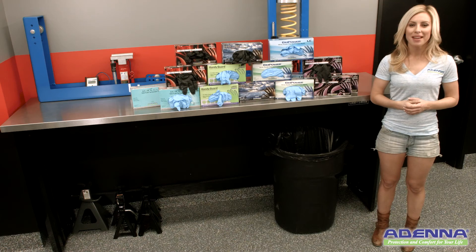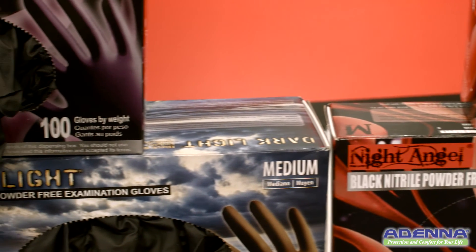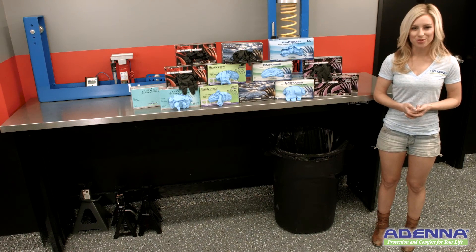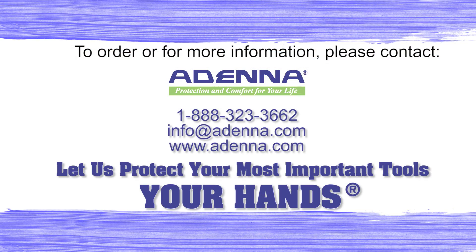Adena provides many nitrile gloves. Some are thicker with long cuffs and better for handling solvents, chemicals, and paints. So let us protect your most important tools — your hands.